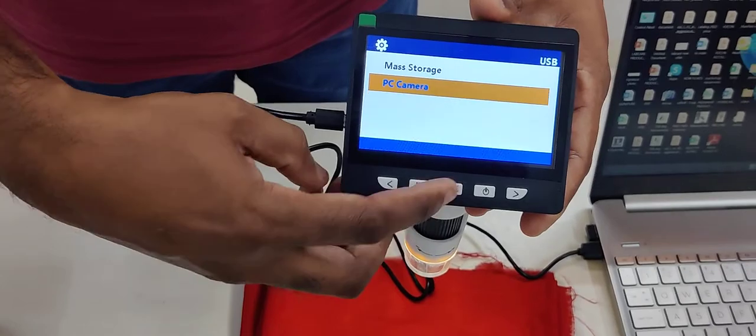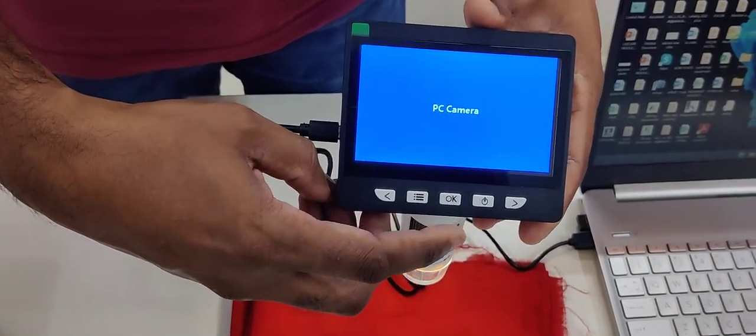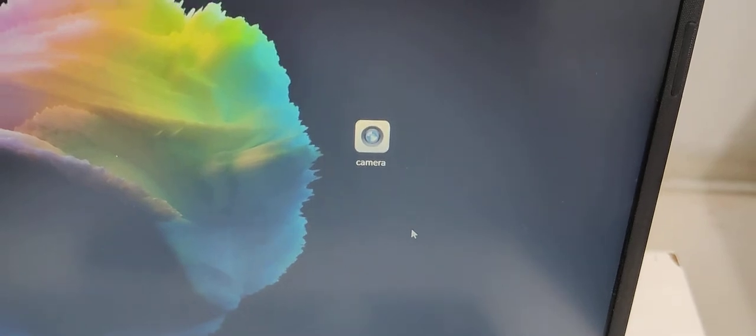Just come to here and just give okay. That's it. This is the software we are going to use.